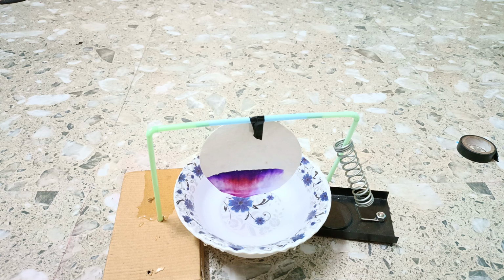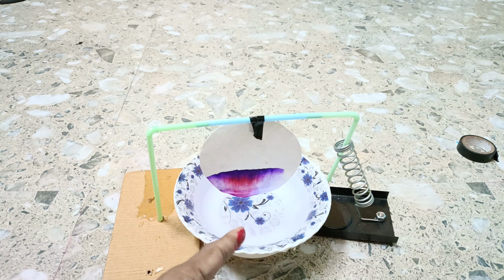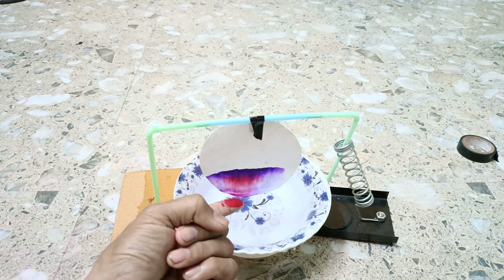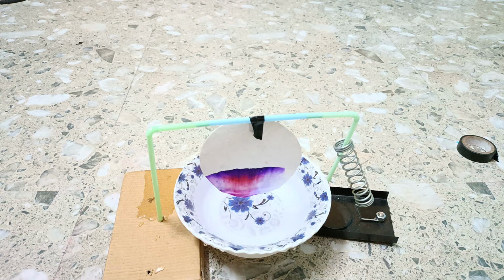This is known as paper chromatography. Dear friends, you can see that the red color is here and the blue color is here. That means you can separate the colors blue and red in this method, and the method of this experiment is known as paper chromatography. You see here how the color is going up. As the color is going up, you can see that the two colors are separated. Here you see the lower one is the red color and the upper one is the blue color. In this way, we can separate the two colors of ink in paper chromatography.